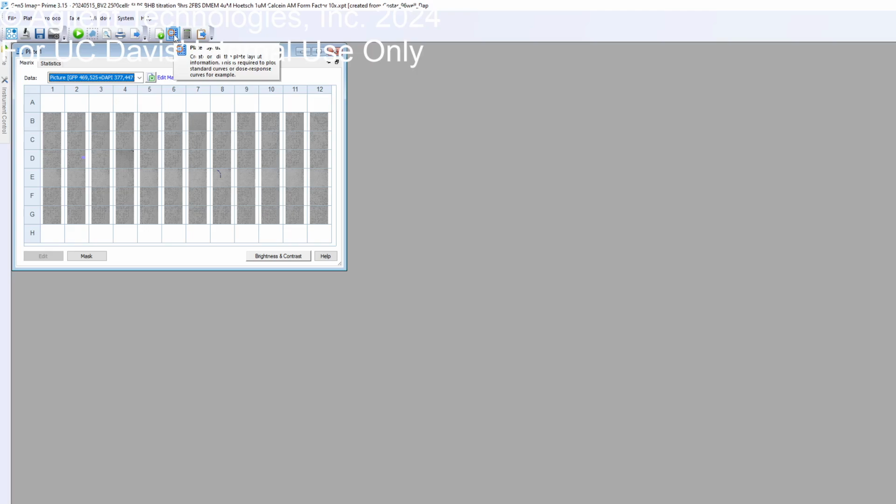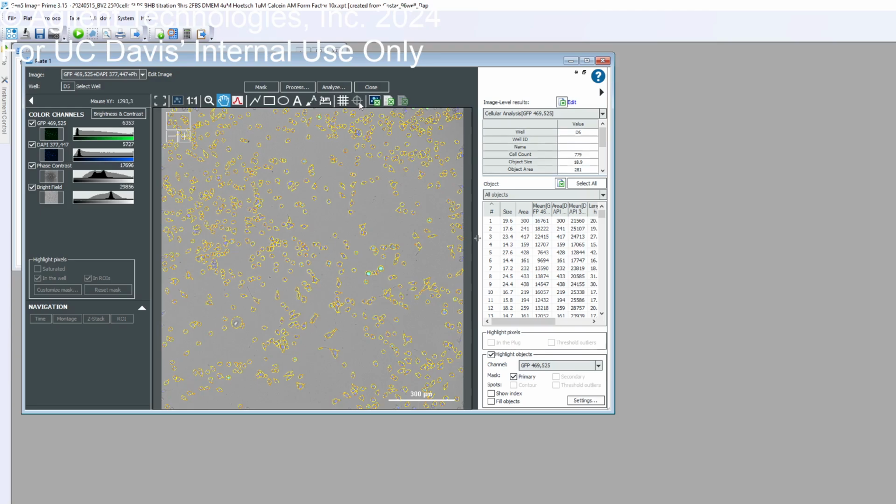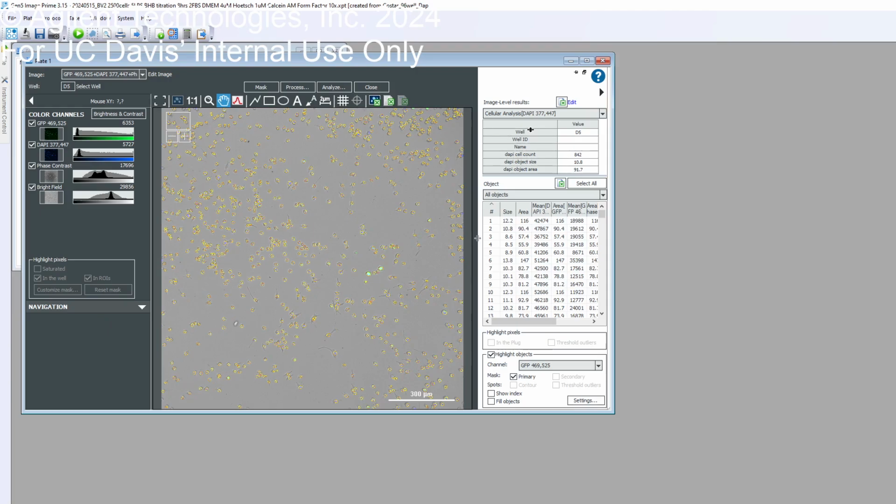So let's just go to any of your images first. We have a lot of analysis already applied, so which one do you think is not really relevant? Then we can just delete that. It's going to save you some file size, because otherwise it's going to keep everything in the protocol. Probably the DAPI statistics. Probably the GFP statistics too. And then you want to keep the circularity.